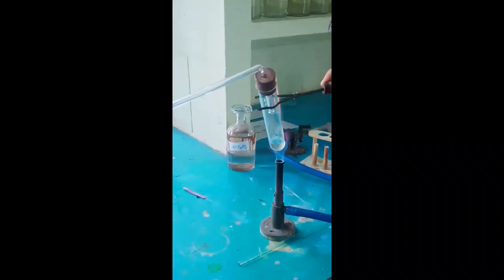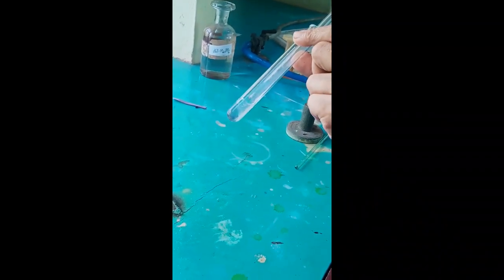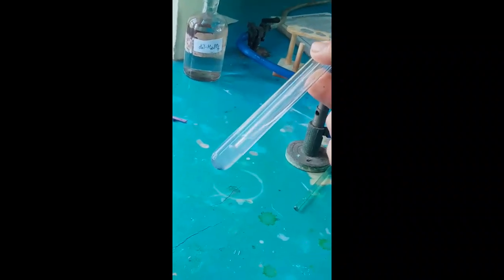Another test for HCl, hydrogen chloride, is when HCl vapor is passed through silver nitrate solution. So this is silver nitrate solution. On passing HCl gas through silver nitrate solution, what do you observe? A white precipitate is formed. This is the white precipitate which is obtained by passing HCl gas through silver nitrate solution.